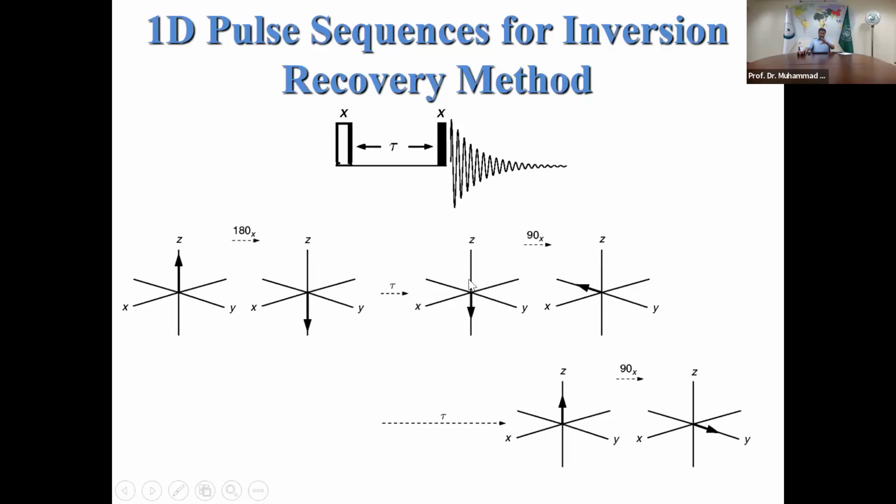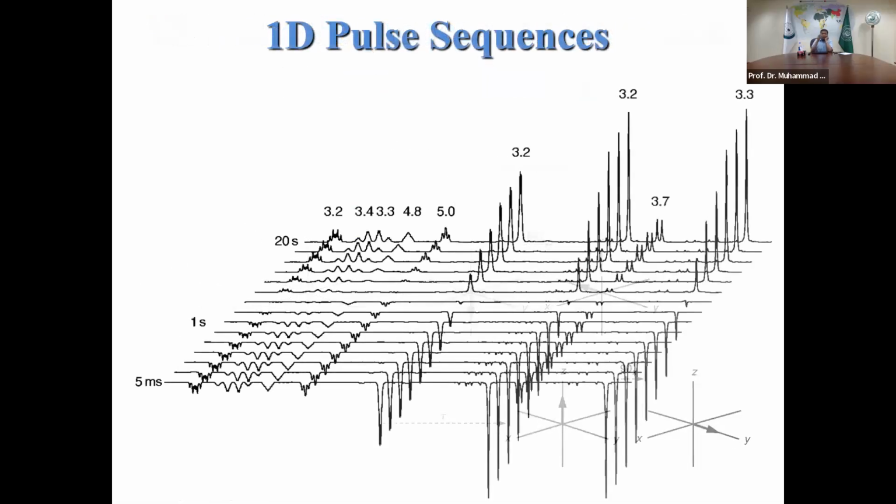and when you give a 90x pulse, you would get this on a different phase. For instance, here, when it will grow up, then you see a positive Y pulse. FID would be recorded with a different phase, and you get this kind of a spectrum. So assume that you have so many different protons.